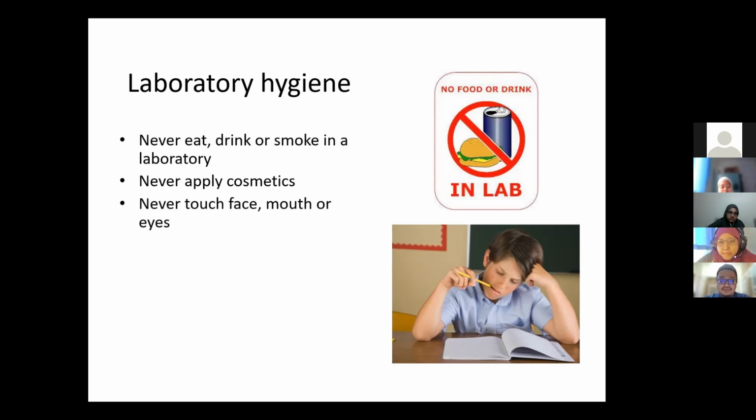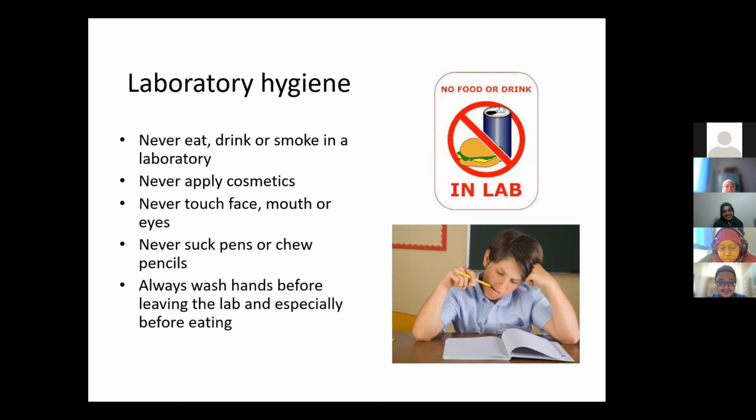Never touch face, mouth or eyes. Okay, so we wear protection over them. Never suck pens or chew pencils. Okay, only kids do this. Of course, all of you still have kids in you, but not in the lab lah. Do it elsewhere. Okay, always wash hands before leaving the lab, and especially before eating.